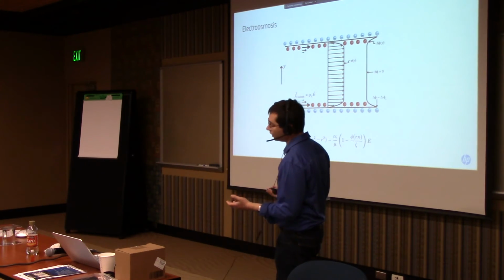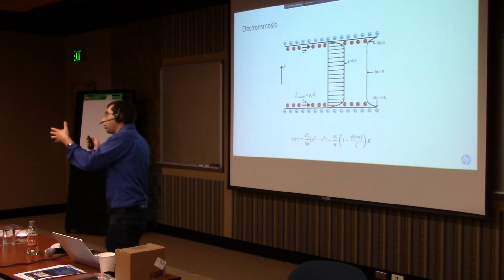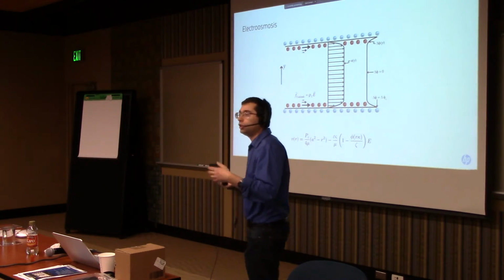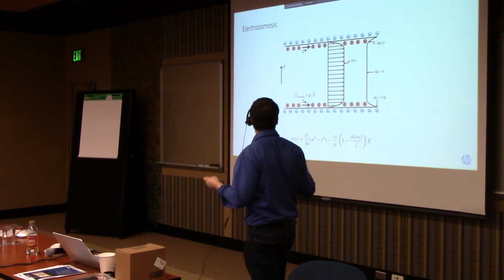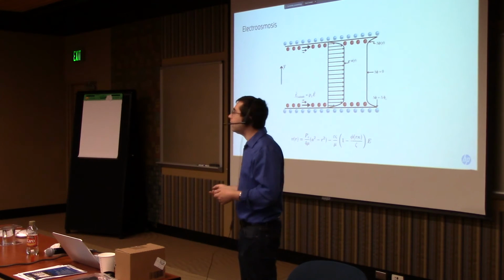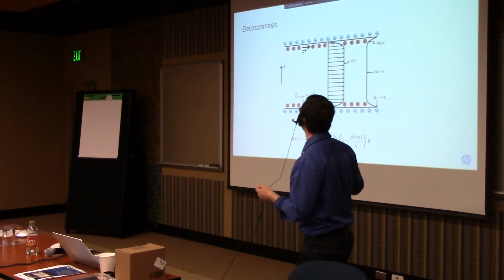And as it does, these charges will hit water molecules, neutral molecules. They will hit the neutral molecules, and it will cause these molecules to go downstream as well, sort of follow them. And it will keep going, and it will start dragging the water behind them.